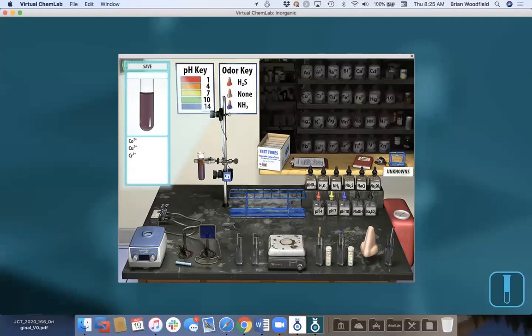So I can go to pH 4, and see, hey, there's my litmus paper, pH 4, here's pH 7, here's pH 10, and I show the chemistry of what's going on when you go to pH 10. So everything forms a precipitate, and I could centrifuge that if I want and force it all to the bottom, or I can go to sodium hydroxide and then show that the chromium is in solution, but I add sodium.